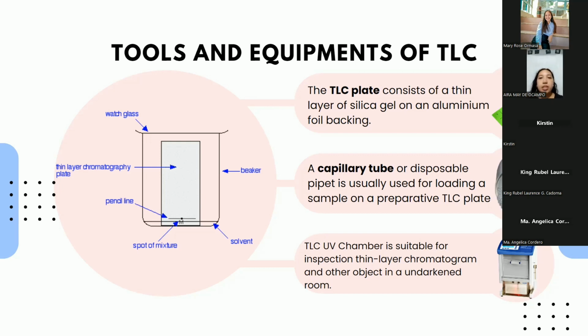This chamber is used for development of TLC plates as part of the TLC workflow. Included po niya are rectangular and cylindrical tanks na meron po siyang different variety of sizes and may accommodate po siya ng wide range of plate sizes.